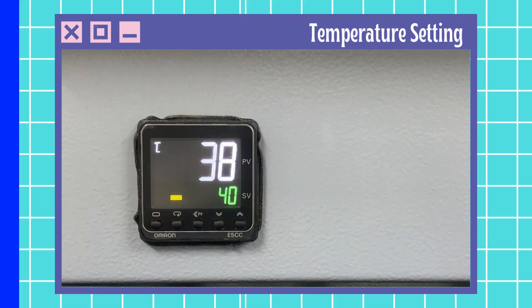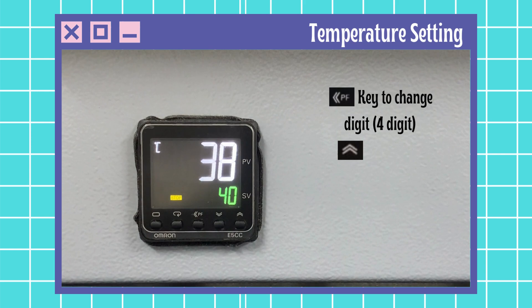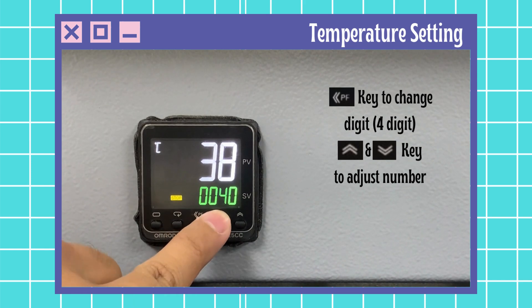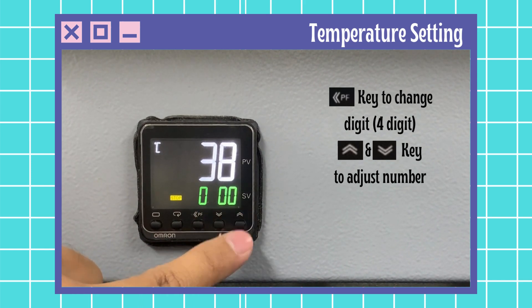Normal setting with timer off. First is the temperature setting — set the desired temperature with the down and up key. For example, set to 100 degrees Celsius. Press the set key to change digit and set parameter with the up and down key.